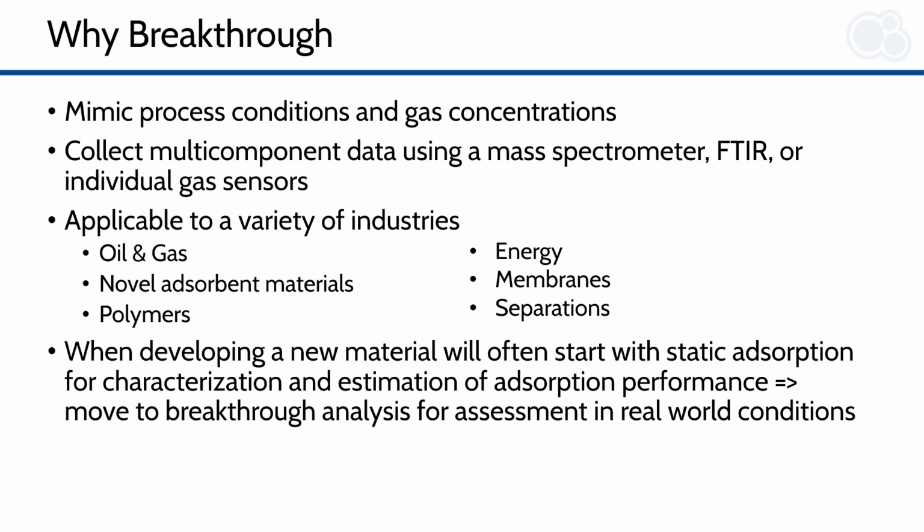Breakthrough is applicable to a variety of different industries, such as oil and gas, energy, novel adsorbent materials, membranes, polymers, and separations. When developing a new material, often you may start with static adsorption for characterization, estimating the adsorption performance and telling whether this is a good candidate material for your real-world application. After that, you may move to breakthrough analysis for assessing it in more real-world conditions to see if it lives up to your expectations based on what it could achieve in the static environment.